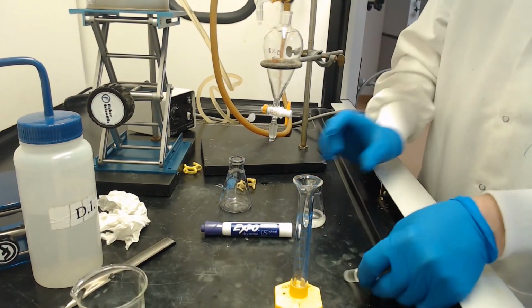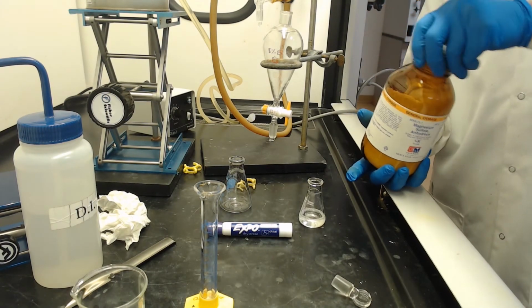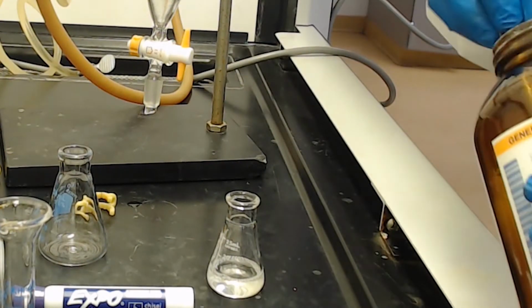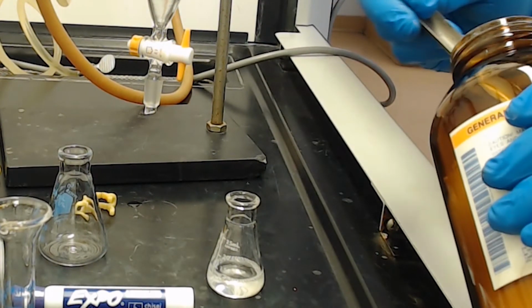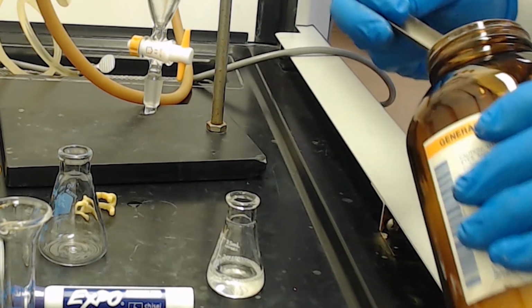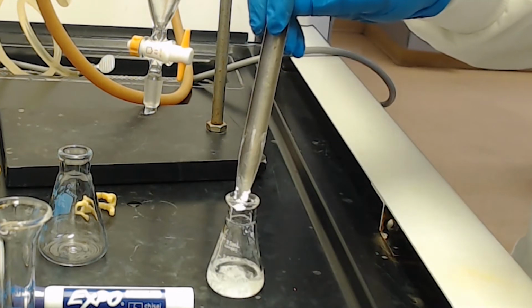So now we need to do the drying step. You can use sodium sulfate. It takes a little longer. It's a little cheaper, so if you're doing an industrial scale, you might want to consider that to save some money, but we're not too interested in that. So this is just kind of eyeballing it. I'm going to just put about that much in there.